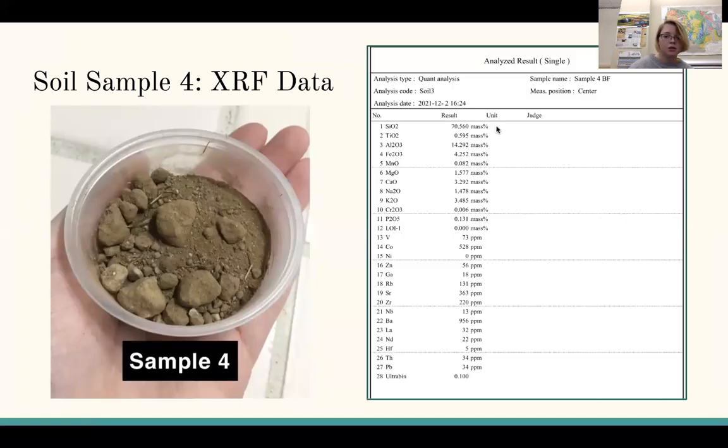And once again, quartz makes up about 70% of the sample, which corresponds to the large peak it has on the XRD graph. Cobalt is relatively high, as well as barium. Barium is a non-essential mineral to plants and may have reached the soil after getting into the groundwater.